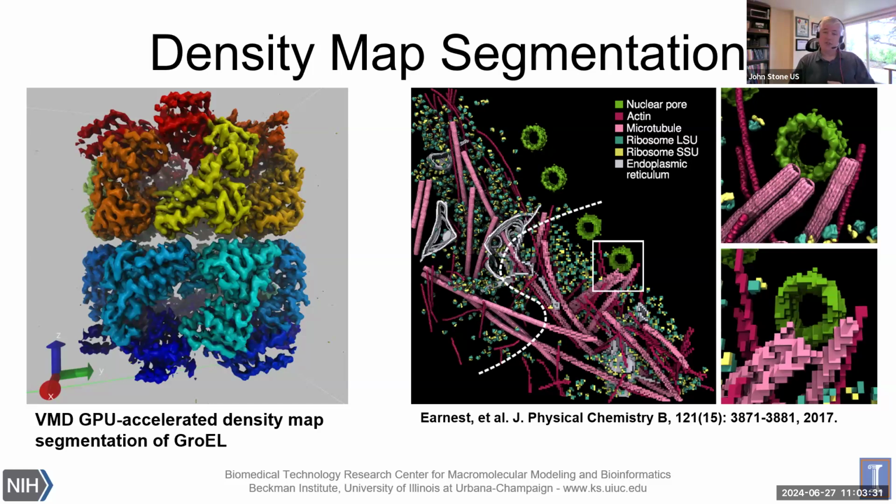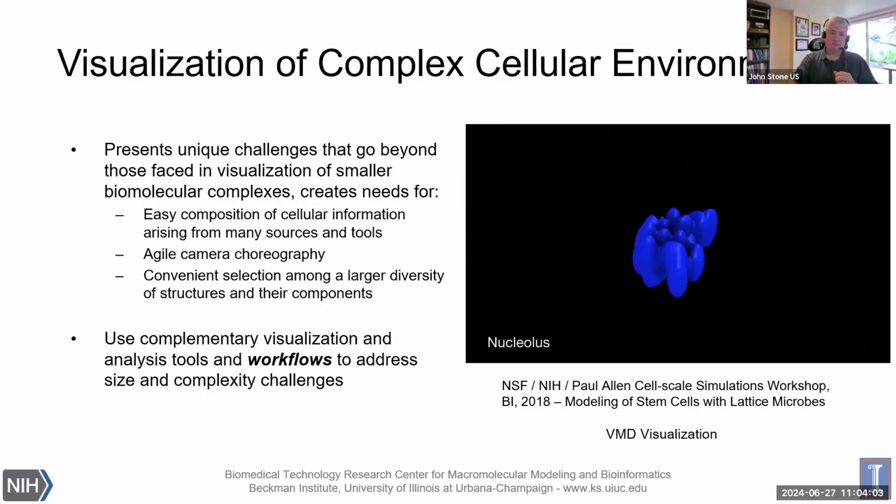At a large scale, these things are used to prepare simulations for cell-scale simulations. For example, the Lattice Microbes software, you can see in the bottom right corner, there's a lattice representation of a 3D tomogram. So the original tomogram is a particular resolution. Those densities are first segmented and then they're classified by what type of particle species they are. And then that becomes input to doing a lattice cell simulation, and the rest is, you know, straightforward.